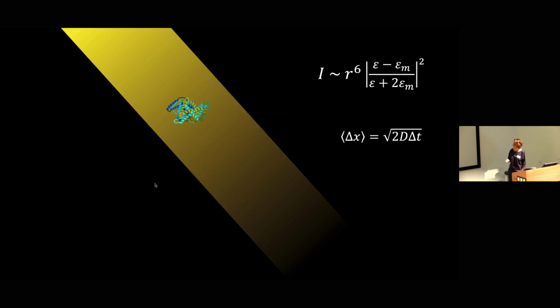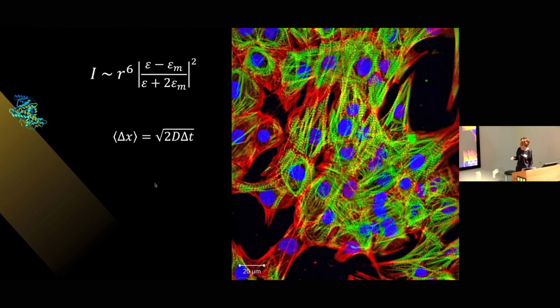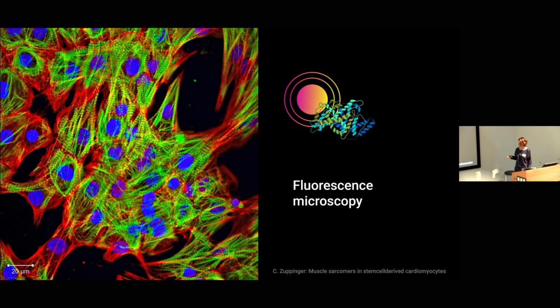So it's extremely difficult. What made it possible is fluorescence microscopy. It's, of course, a very powerful method, but it has its drawbacks. For instance, labeling can lead to undesirable modifications, especially for very tiny molecules. And also, we see only predefined targets, which means that the unlabeled but potentially important ones remain unseen.